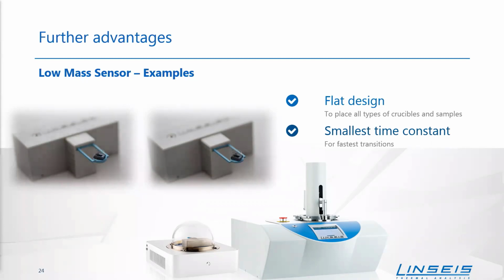Another point is what happens if you have to measure your sample directly because it just doesn't fit any crucible you have in your lab. So at the left side, you can see our standard sensor again, and on the right side, our low mass sensor. At the left side, you can see the sample is just placed on the positioning border of our sensor. On the right side, it would work because there's good contact between the sensor and the sample itself over the complete range of our sensor here.